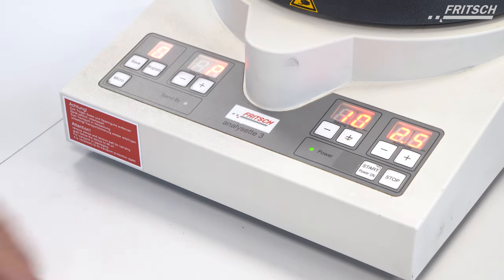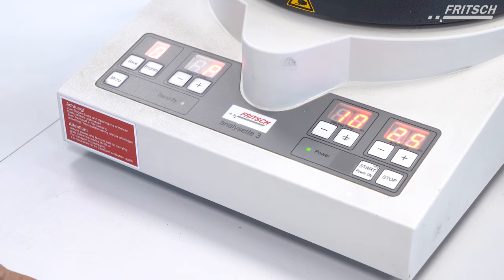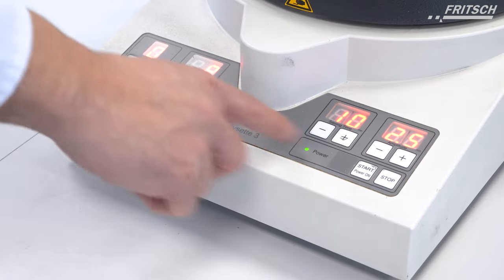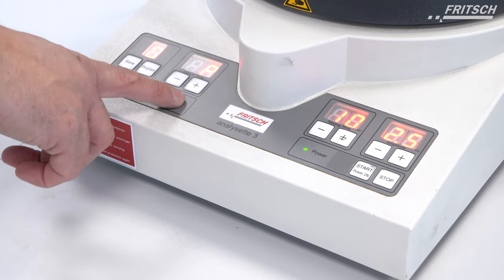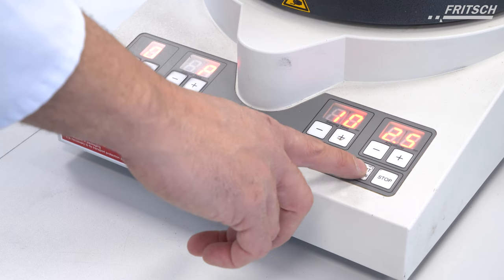Now we can set up the parameters of the NLZ3, which includes the amplitude. We work typically between 1.5 and 2.5 millimeters. For very fine samples we choose a high amplitude of 2.5 millimeters. The sieving time is 10 minutes and we work without interval mode — permanently. We can now start the sieving procedure.